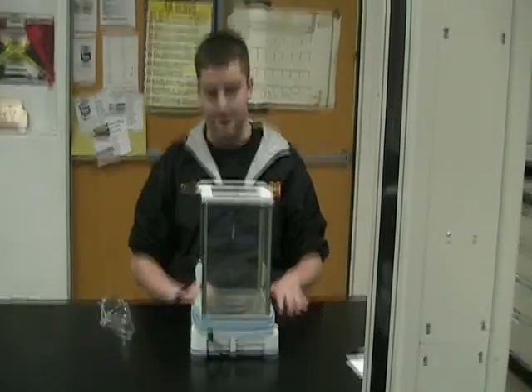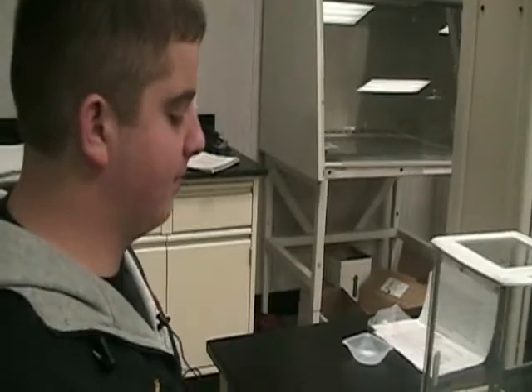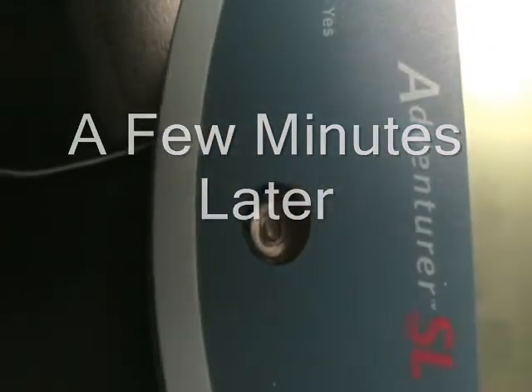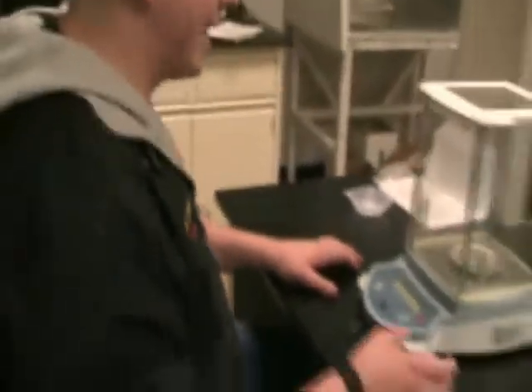I'll tell you how to prepare your balance before you start measuring substances. Before we start weighing, let me show you how to level the balance. There's a little black circle and an air bubble. If the bubble is not in the circle, use the four legs on the bottom of the analytical scale and twist them until the air bubble moves into the black circle. Make sure the air bubble is right in the center of the black circle.